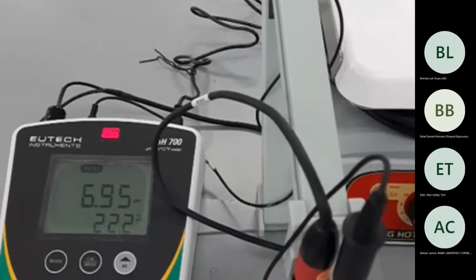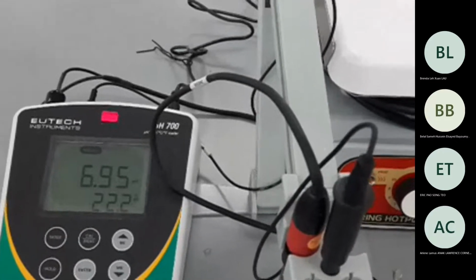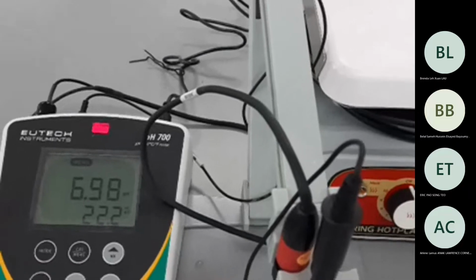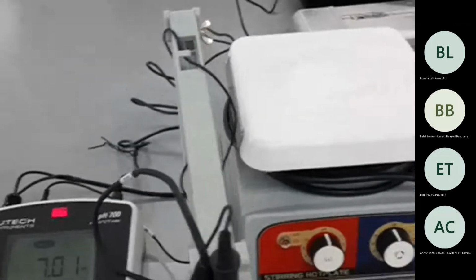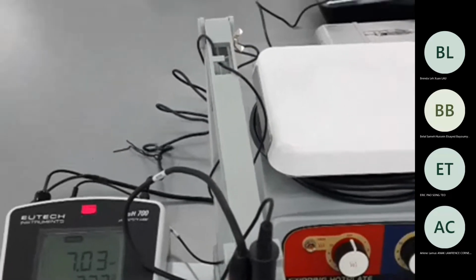Need to wait a bit till it reaches the maximum and becomes ready for us to collect the reading. So Vanessa and Noor, are you doing the same? Are you taking the pH of the distilled water now?